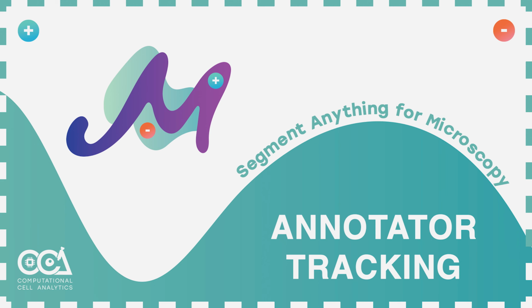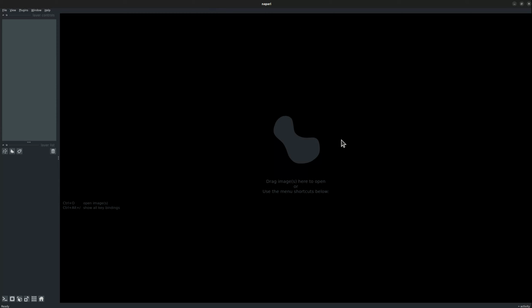In this tutorial video, we'll be learning about the tracking functionality to track objects over a series of time. Note for this video, it's expected that you're familiar with the installation and the Napari based annotation tool. Okay, so let's get started.